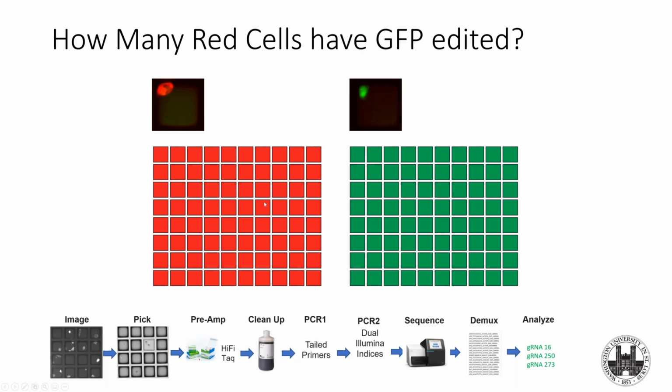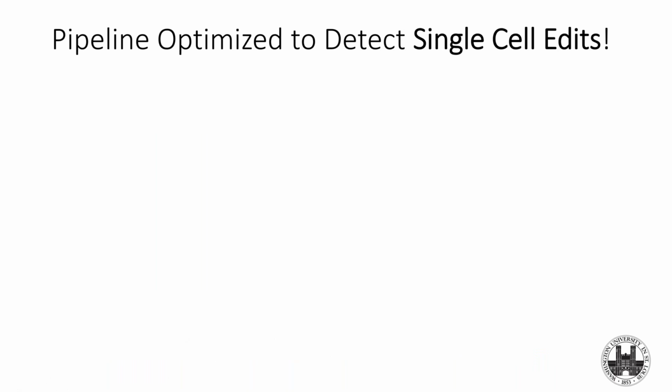And when we do that, these are the results: we only made 2 mistakes. Only 2 of these cells that we thought were red, we found some reads that were GFP intact. For all the other ones, all of the reads showed that the GFP was in fact perturbed, was disrupted. On the other hand, the cells that we picked that were green and not red turned out to be perfect in this case, where every single cell we found had the fully intact GFP sequence. It did not have a disrupted GFP sequence. And so this is great.